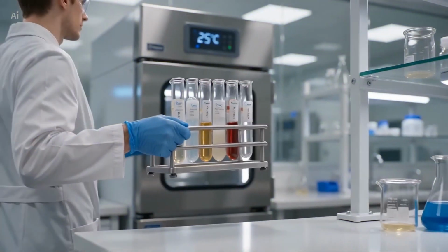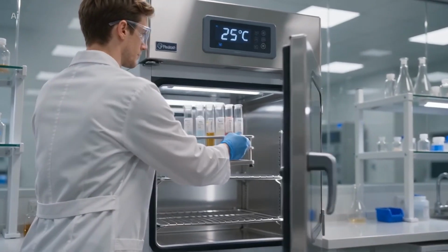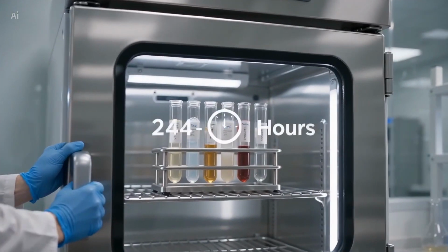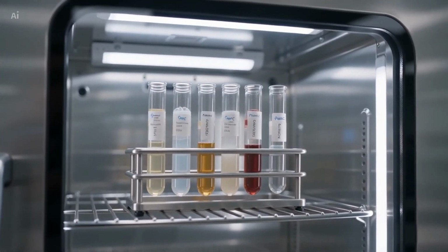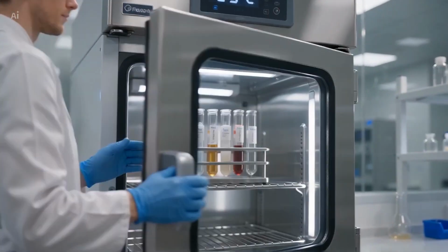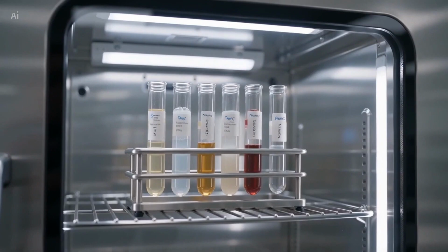Once all transfers have been completed, incubate the inoculated cultures at 25 degrees Celsius for 24 to 48 hours. During incubation, the transferred microorganisms will grow in the fresh culture media, allowing successful subculturing to be confirmed. After incubating the inoculated cultures at 25 degrees Celsius for 24 to 48 hours, microbial growth should be visible in all the freshly inoculated media.